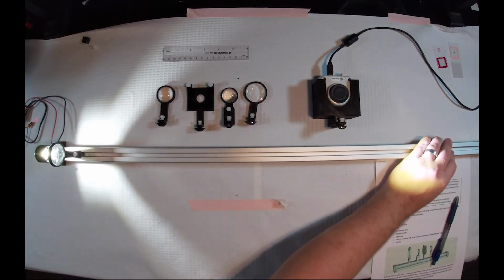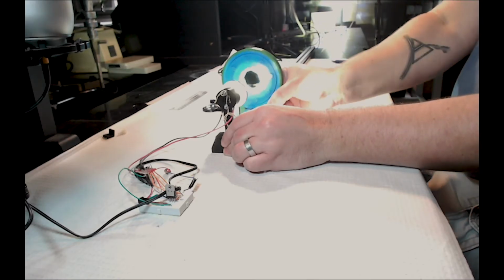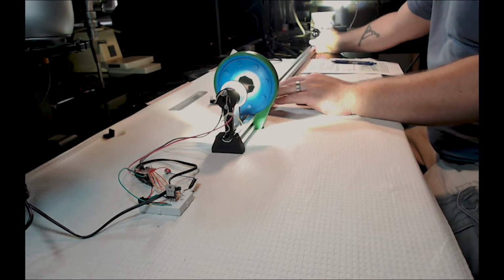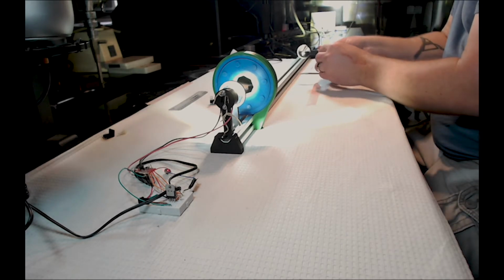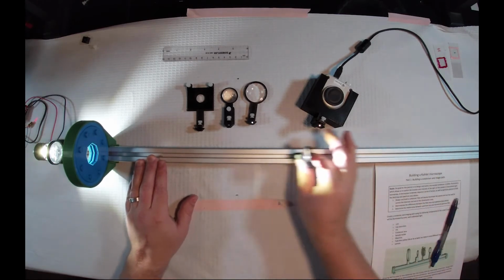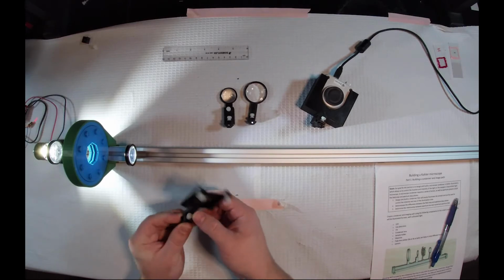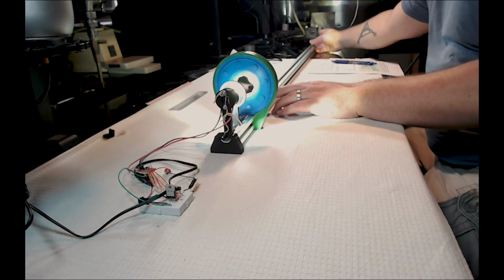So I will assemble these components and then we will get everything aligned. Now, because we have a curved surface on our condenser lens, one side curved, one side flat, we will need to make sure that we put the curved side towards the collimated rays, which these should be relatively collimated. Next, we're going to have our sample plane that we can mount slides and rulers in.